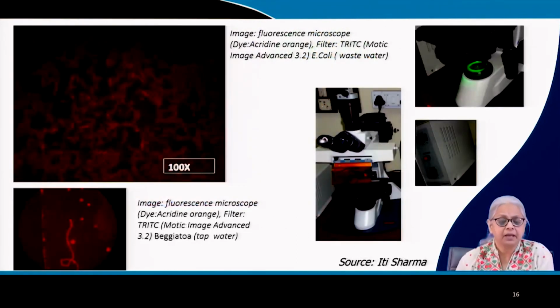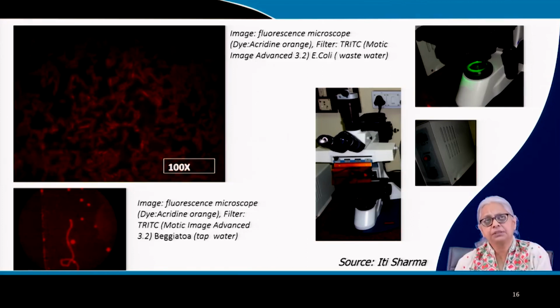All right, so here we have more images using fluorescence microscopy, and we have limited ourselves up until now to acridine orange.